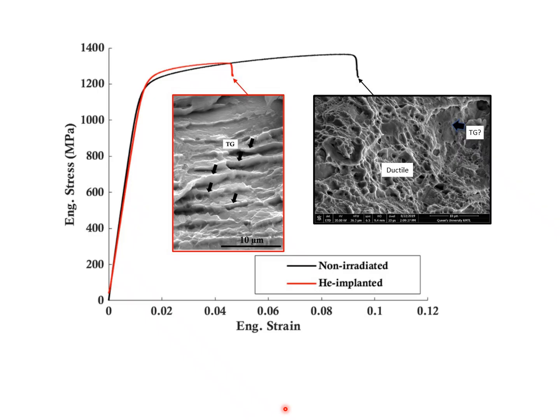Once you've produced them, let's assume you've done that from the fabrication, when you create a fracture surface, as you have here, they show up as protrusions because they're hard, and you get cracking along these platelets. I've seen similar things in stress corrosion cracking tests, where people see these protrusions at the surface and say, aha, that's because of localized deformation. Not necessarily. It could be the same thing as that channel fracture.